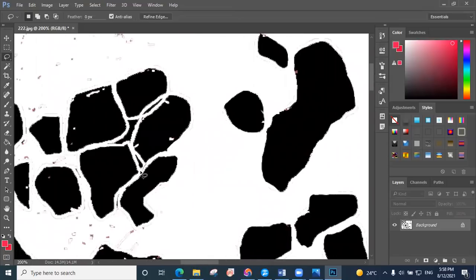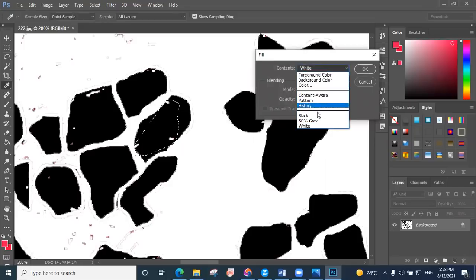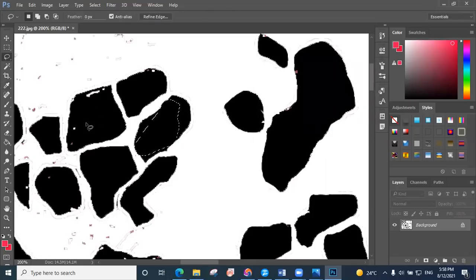I suggest doing the same steps if you face this problem. The second video will show you one with clear black and white, which is easier and will not have this issue. It will take mostly, as I said before, about 10 or 15 minutes.